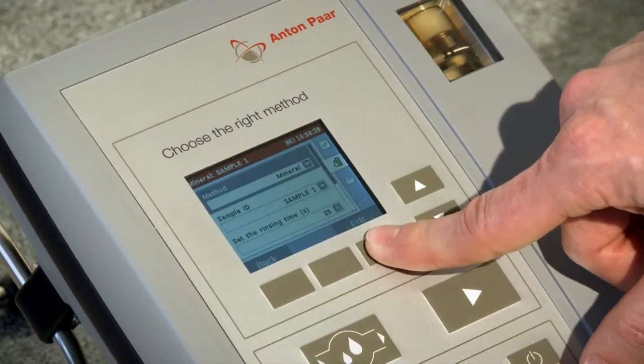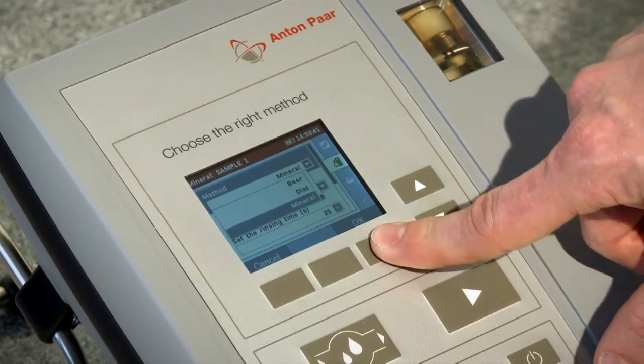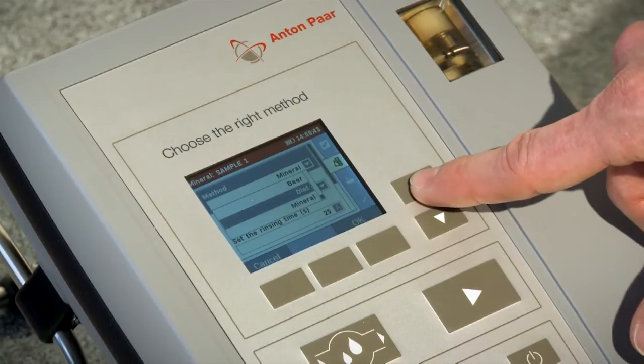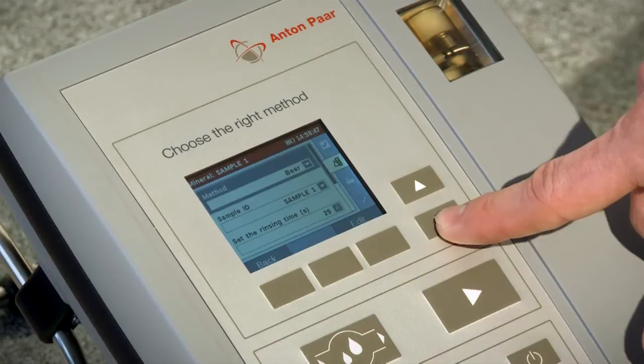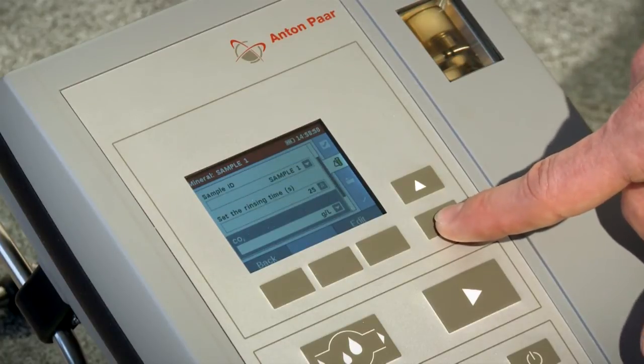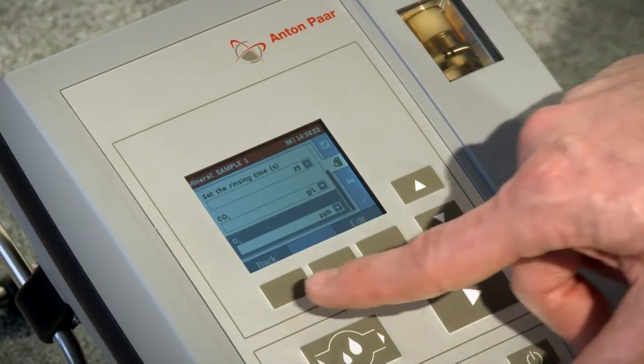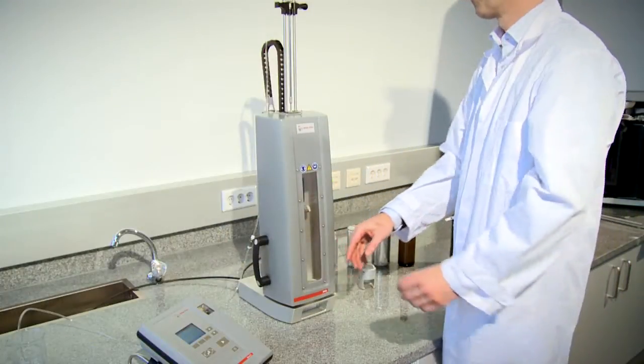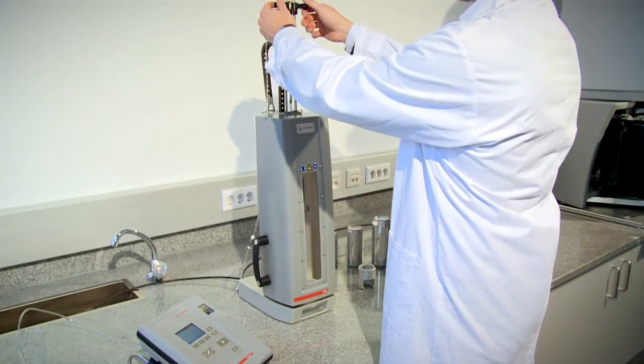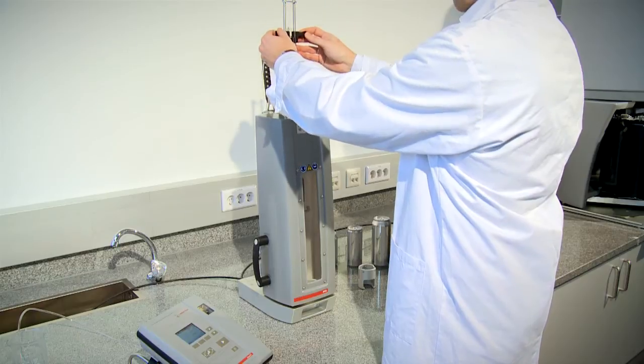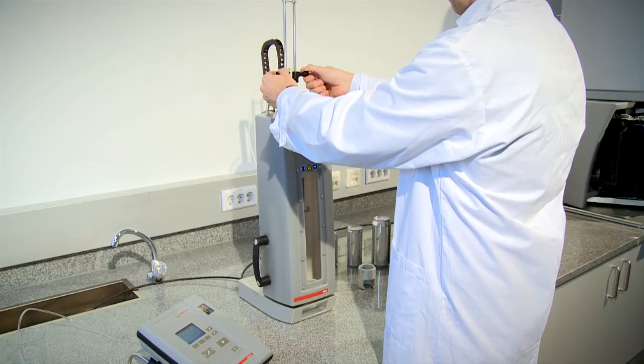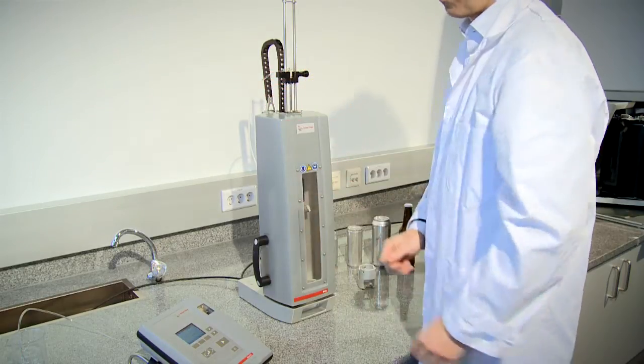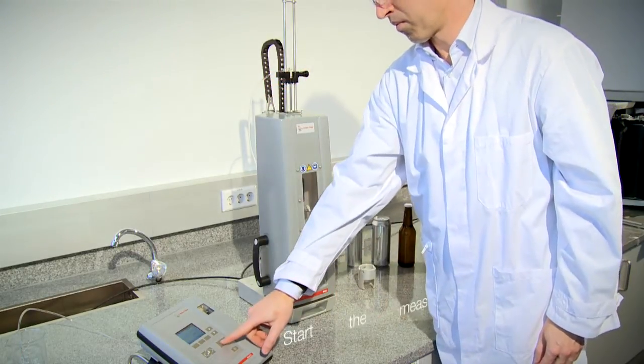Press the sample key on CBOX QC and select your method and further settings of choice. Be sure to set the appropriate rinse time. Insert the sample tube into the pierced container and secure the tube's position. Now you can initiate the measurement by pressing the start key.